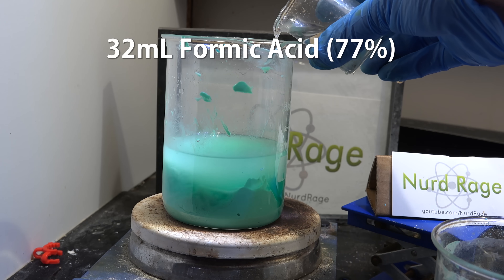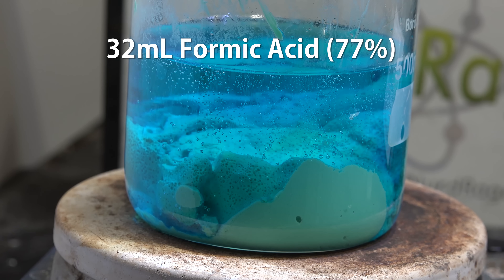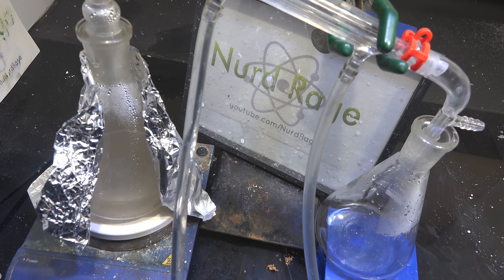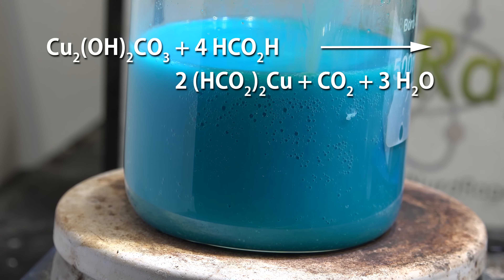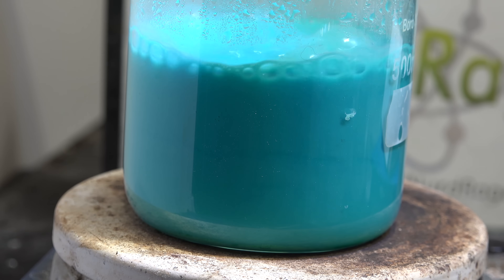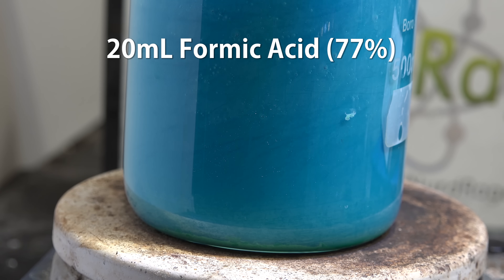To make copper formate we add in formic acid. I'm using 32mL at first of what I thought was an azeotropic mixture of 77%. We made this formic acid a while back from glycerol and oxalic acid. Stirring and heating helps to drive the reaction forward. The formic acid reacts with the copper carbonate hydroxide to make copper formate. I thought it would all react but when it did not, I thought I didn't have enough water so I added more. It turns out I was wrong, and it still wasn't reacting, so I added in another 20mL of formic acid.